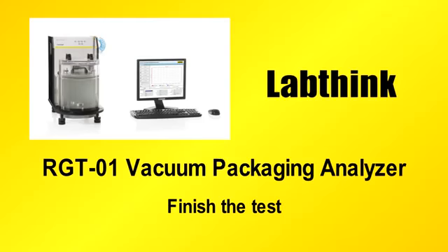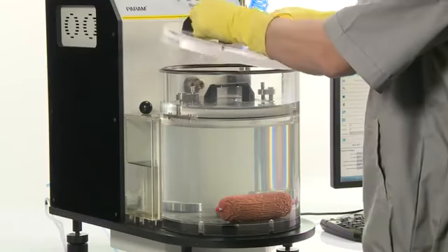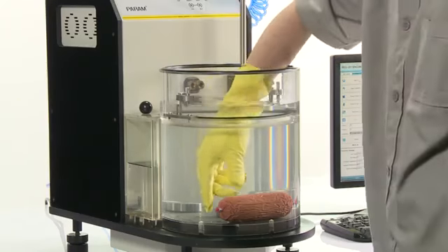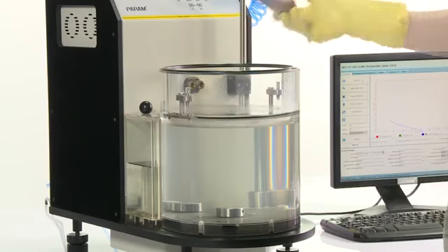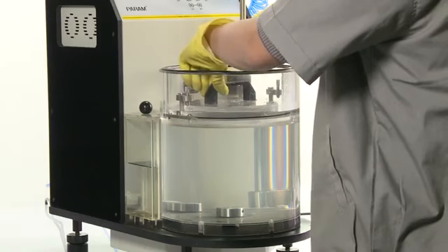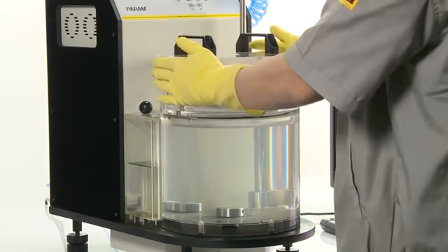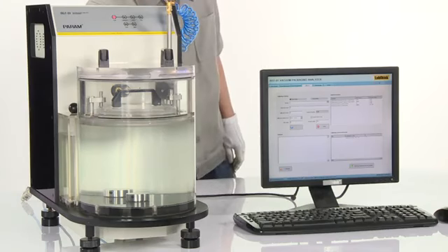Finish the test. When test finishes, remove the specimen. Turn off the mainframe and the monitor.